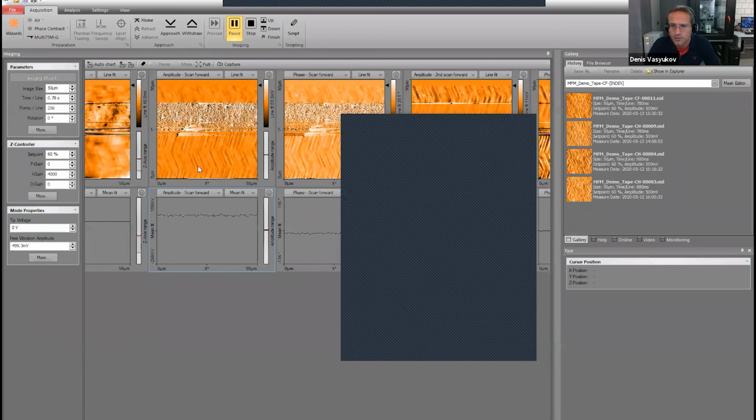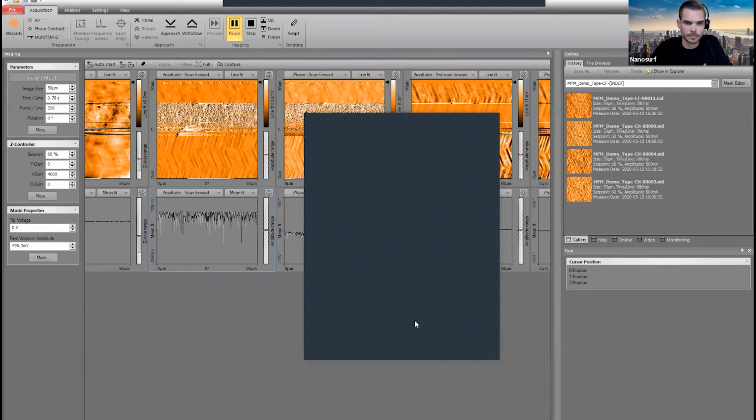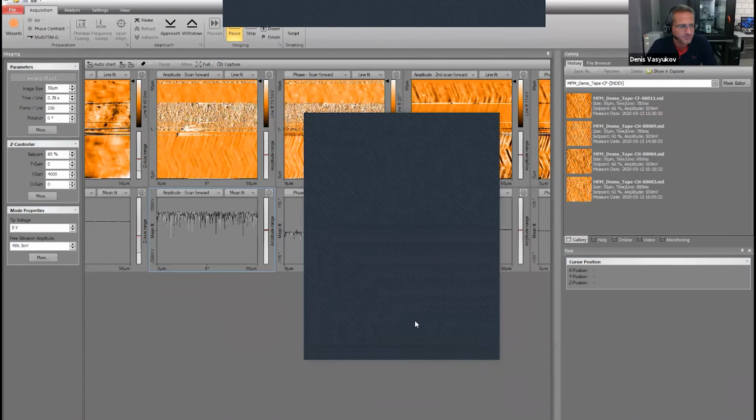So here at the bottom, the sample is flat. But because I was opening and closing the system and we don't work in a clean room, eventually some dust gets into it. Then either you scan this place a few more times to get rid of the dust, so the tip moves the dust to the side and the image can recover, or you just look for another place on the sample to get better images. This wouldn't usually happen in the current environment. I mean, this is the fourth or fifth time you're measuring the sample, I think. Yeah, okay.